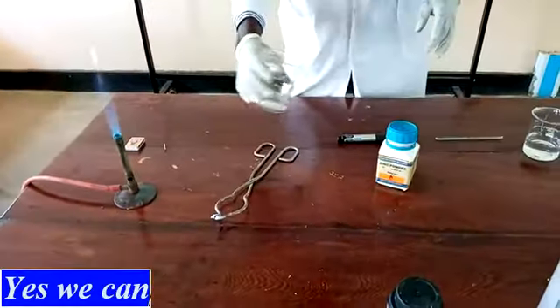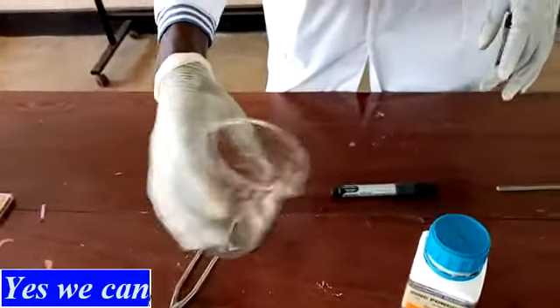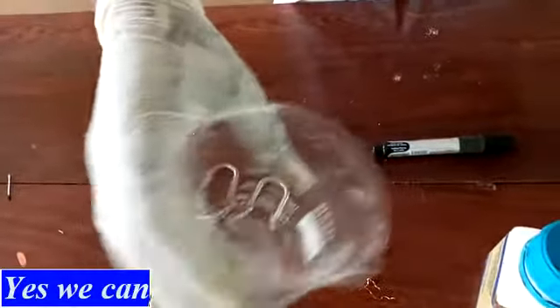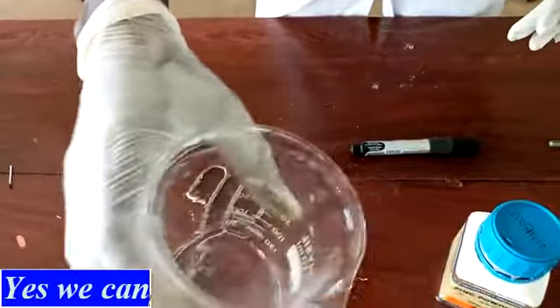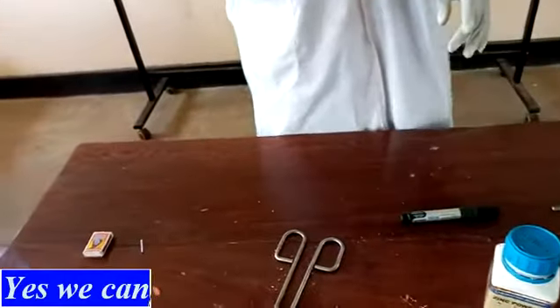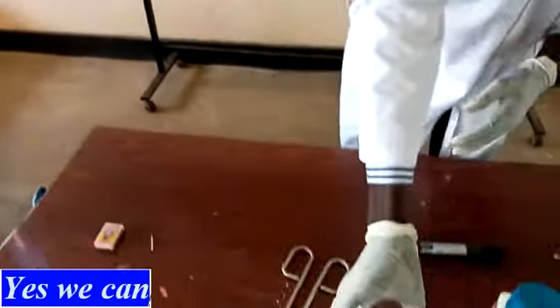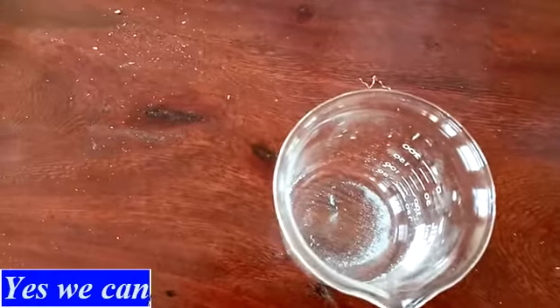So I shake to dissolve it. So now this is what you form. You can realize that even calcium oxide, when you dissolve it in water, it does not completely dissolve.